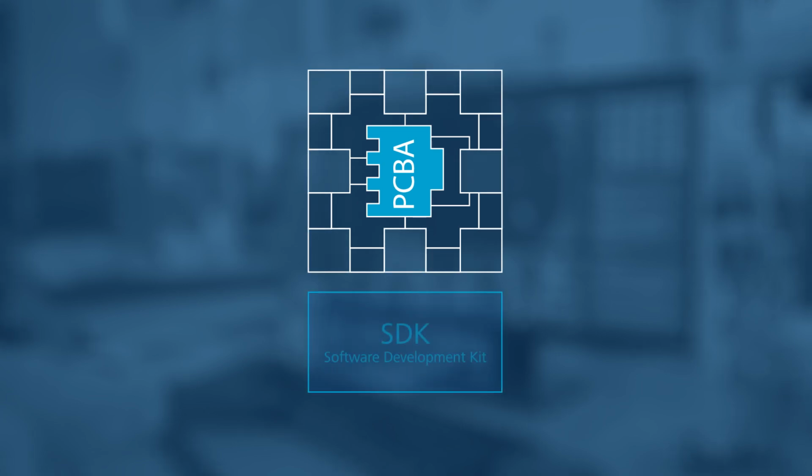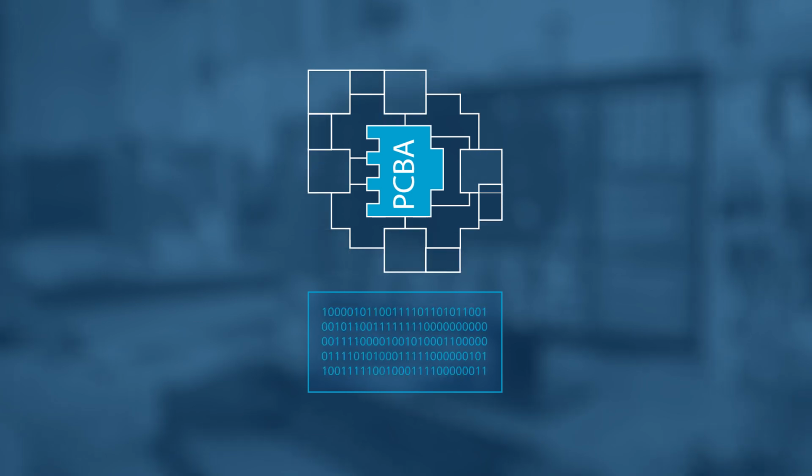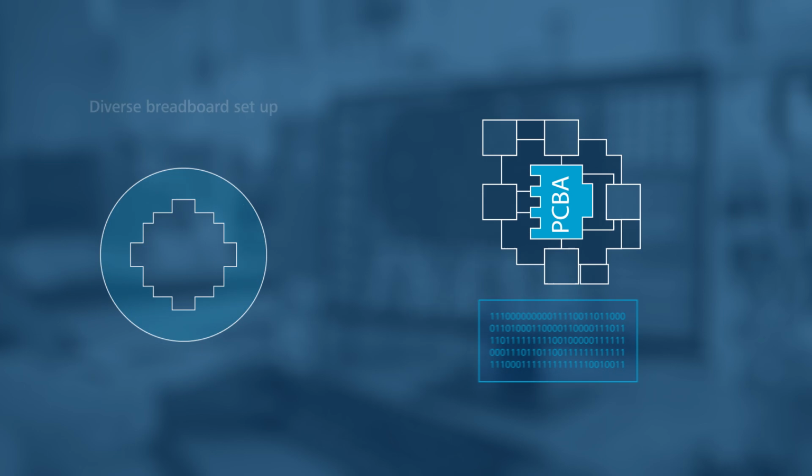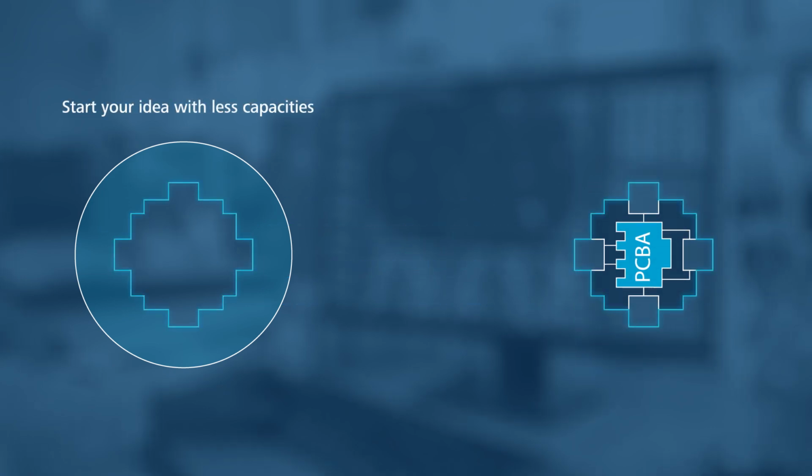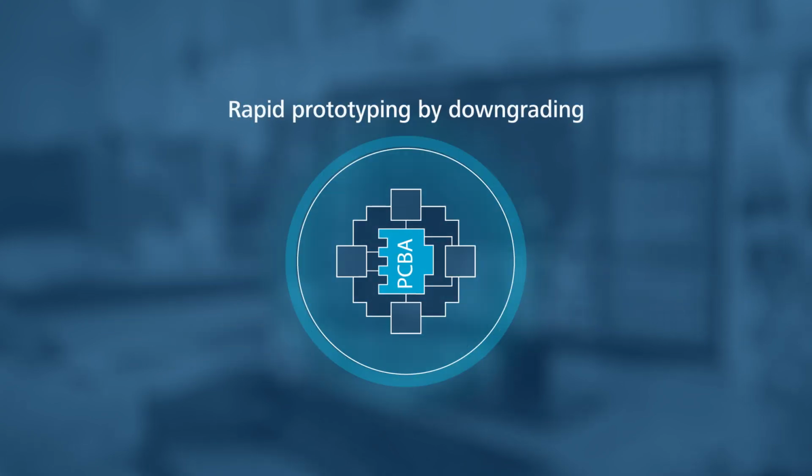The pre-developed PCBA and the included software development kit allow you to test and develop diverse configurations just by downgrading. Rapid breadboard setup is easy, and you get an early and safe confirmation of feasibility. Most of the work is done. Through downgrading an over-engineered platform, rapid prototyping comes true.